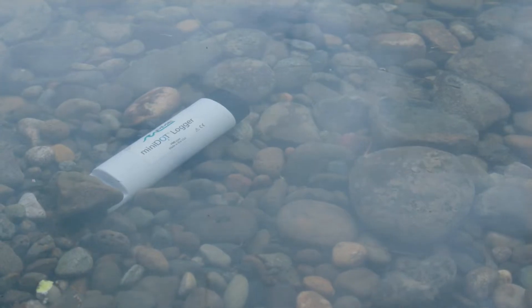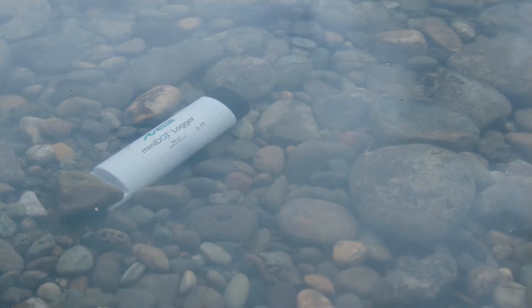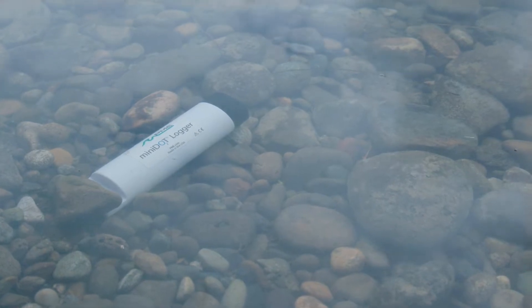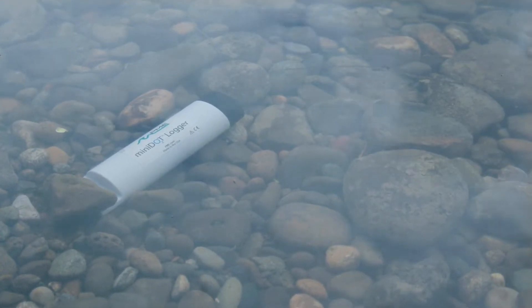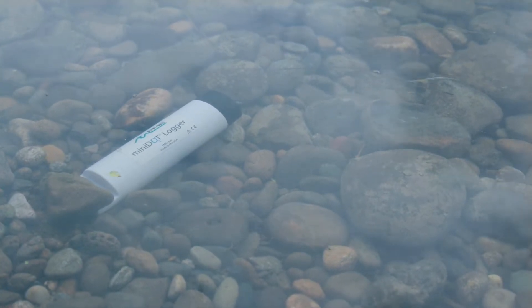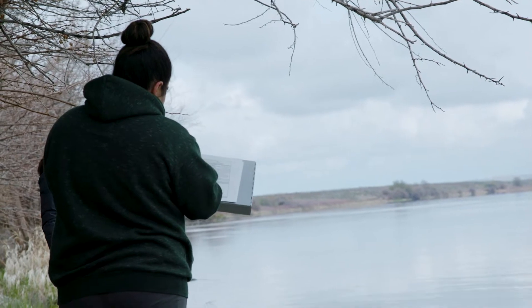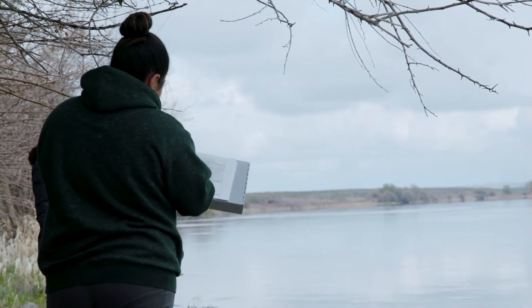Ideally, elevate the sensor off the riverbed at least 10 centimeters by setting it on a rock or sticking the white base vertically into soft sediment. If you have no choice, it is okay to lay the sensor on the riverbed. If needed, secure the sensor so it does not move downstream. On the metadata sheet, record the date, start time, and time zone for the sensor deployment. You will leave the sensor in the water while you sample.